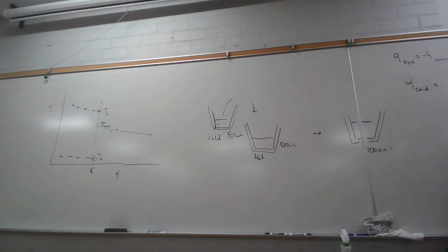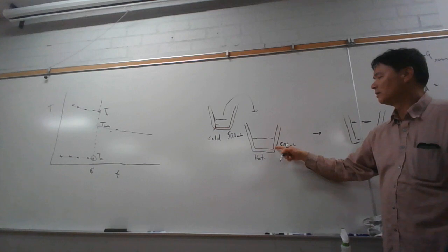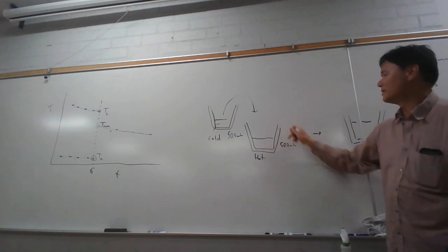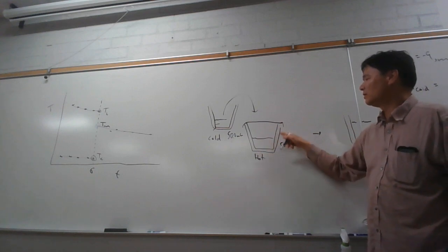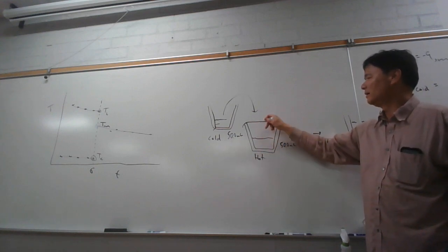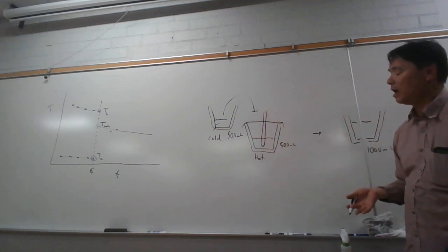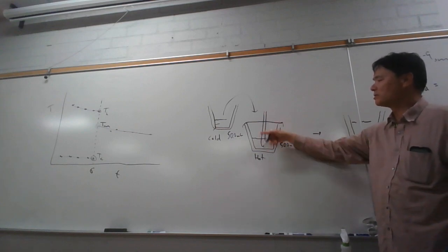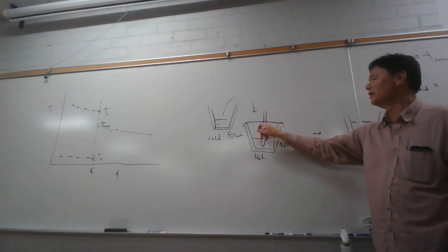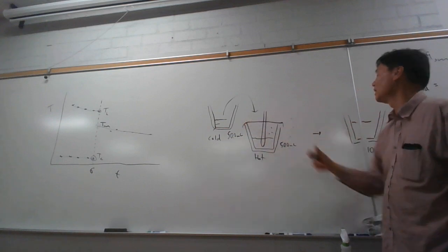However, the surroundings is not just the hot water, because not only is the hot water going to cool down, what else did I say was going to cool down? The cup. Now the cup is what we call the calorimeter, because the cup consists of the styrofoam, the lid, the probe, because the probe initially was at a hot temperature as well. And so when we pour the cold water in there, all this is going to cool down, including the air in here, which is humid air, and even the air outside.